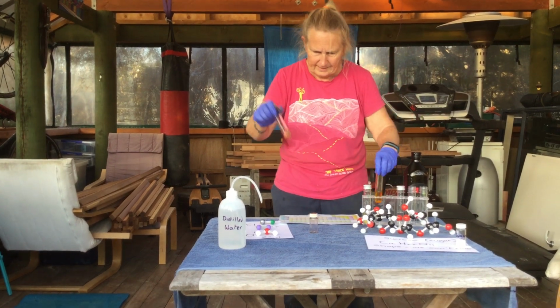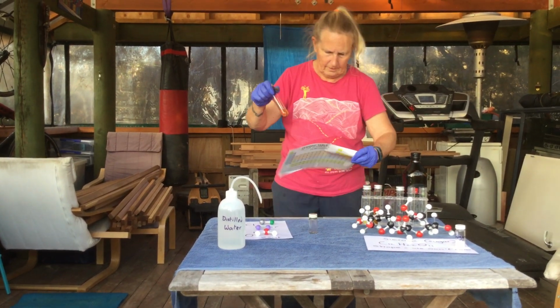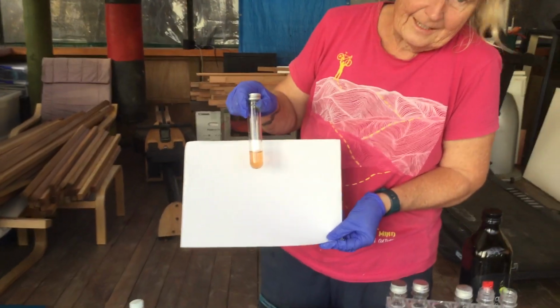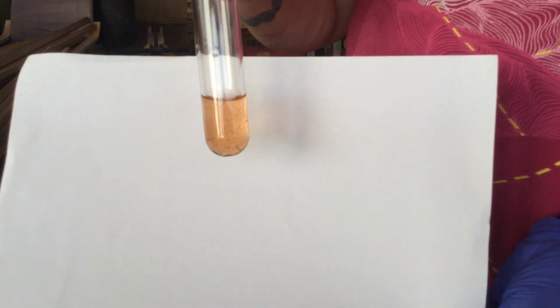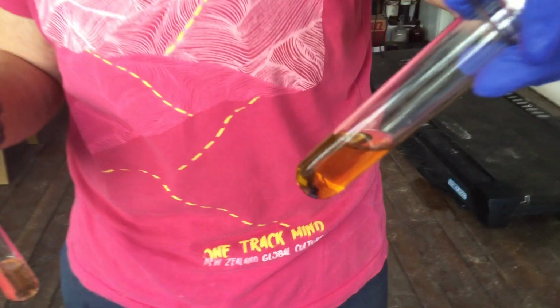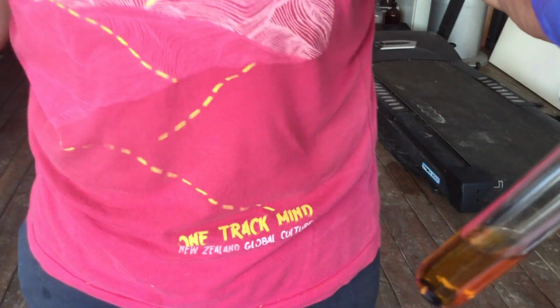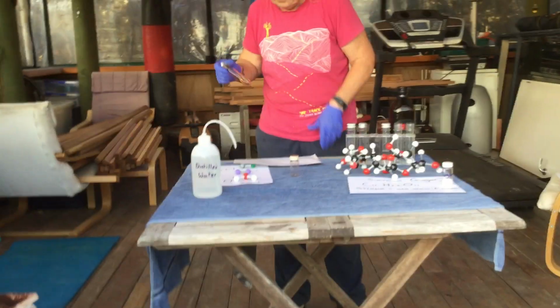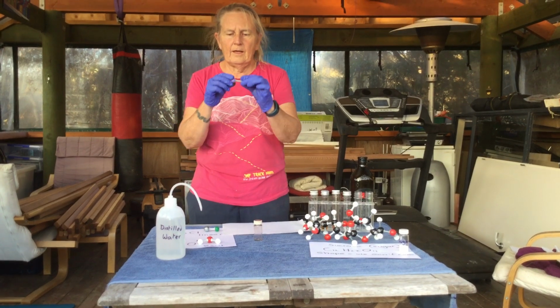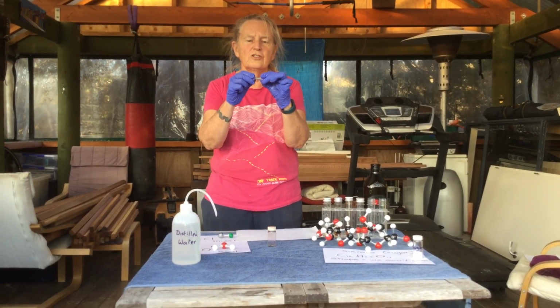Okay, I think you can probably see, if I hold this up against the white here, that this is slowly dissolving. There's quite a bit of iodine in there, and you can see that the oil has definitely changed colour. Even my olive oil has definitely got darker. We'll carry on giving this a shake. Now the reason for this is because they have to share electrons nicely.